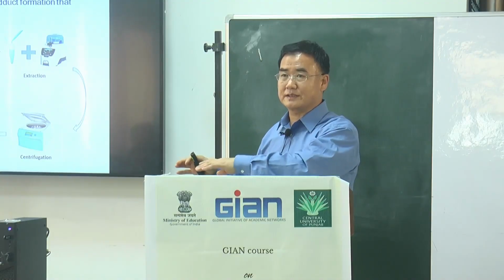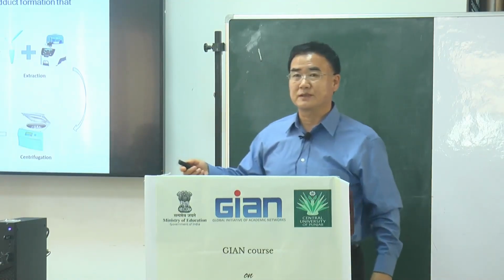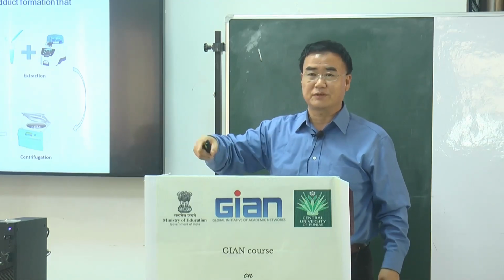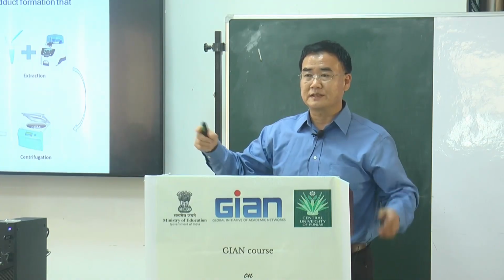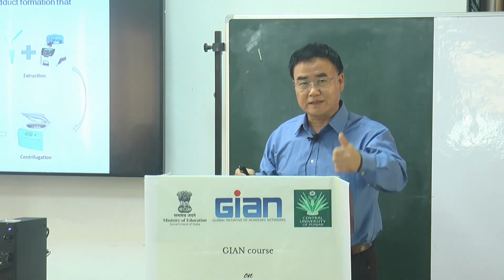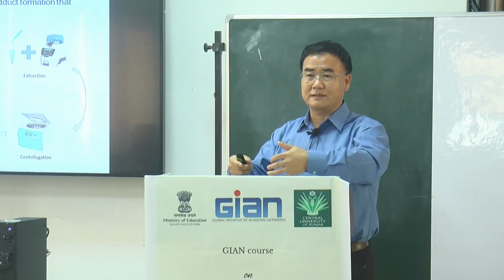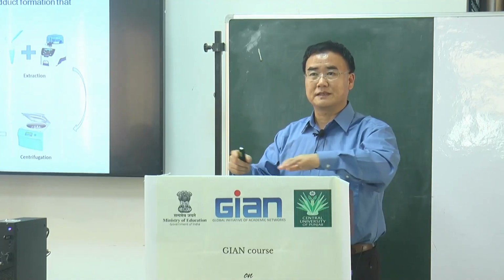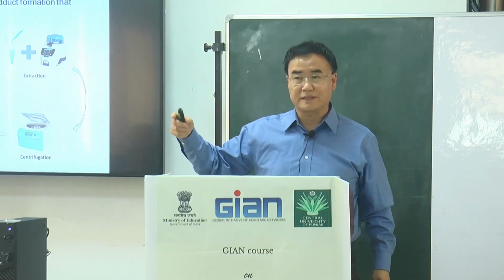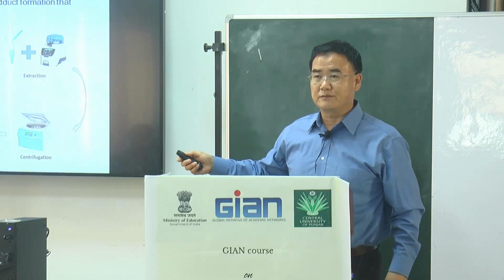So those are very easy to standardize under different conditions with different samples, so people can easily compare in terms of retention time, molecular weight and other minor parameters. If you put them together and set up the index, it is very reproducible.